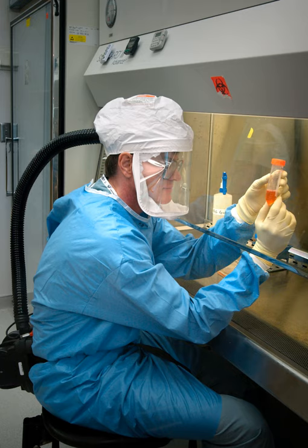Topic: Class 2. Class 2 cabinets provide both kinds of protection, of the samples and of the environment, since makeup air is also HEPA filtered. There are five types: type A1, formerly A, type A2, formerly A/B3, type B1, type B2 and type C1.